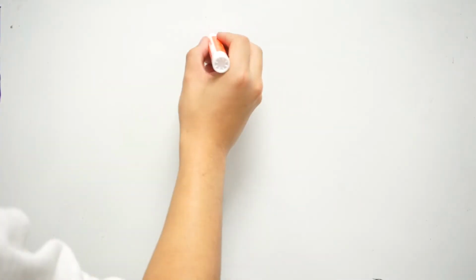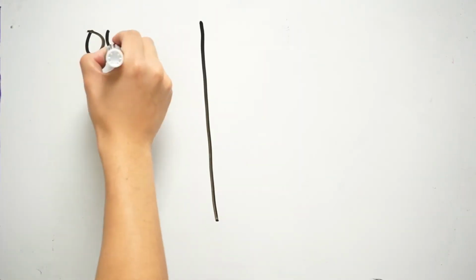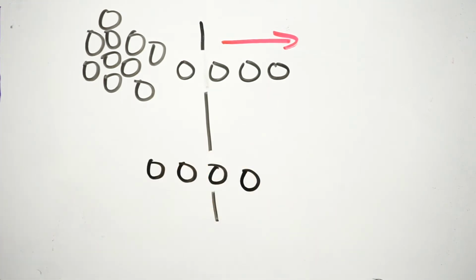Next, we have the stationary phase contribution. Imagine this: a bunch of people waiting to run into a store because there's a big sale going on. Once the door slides open, people begin to head in, not in a huge group, but in a line because the door is only 1 to 2 people wide. Once a few people have finished shopping, they leave through an exit door that is not blocked by the people still trying to get in and take advantage of those sweet, sweet deals.